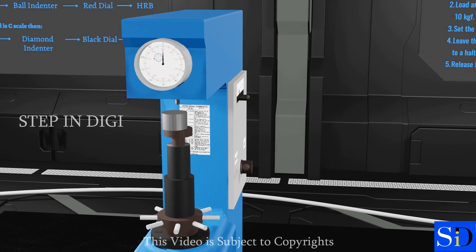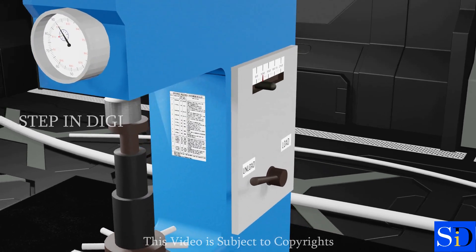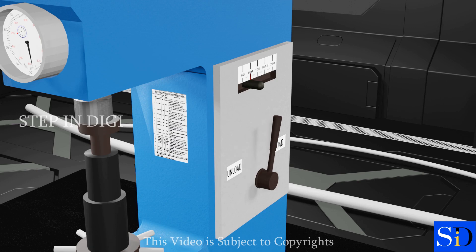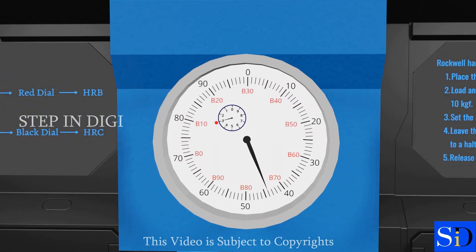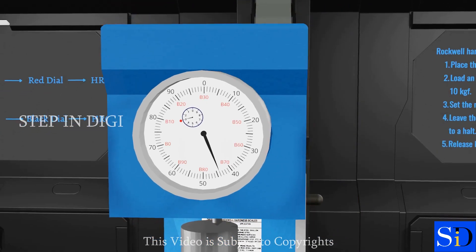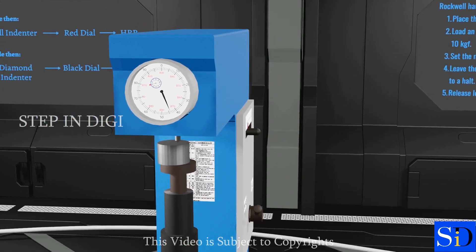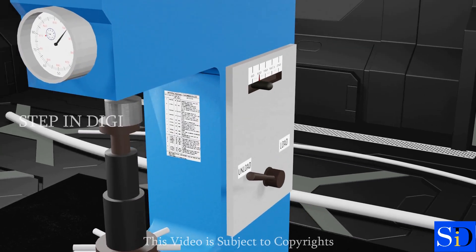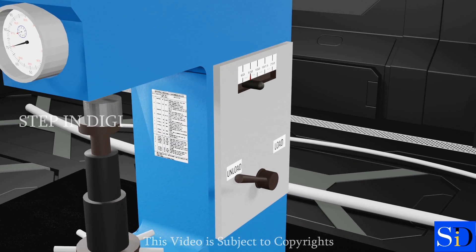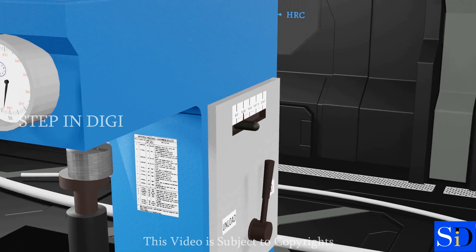While testing the specimen make sure that the indentation should not be made nearer to the edge of a specimen to avoid unnecessary concentration of stresses. The spacing between two adjacent impressions should be at least three times the diameter of indentation. Rapid rate of applying load to the specimen should be avoided. Load applied on the ball may rise a little because of its sudden action. Also rapidly applied load will restrict plastic flow of a material, which produces effect on size of indentation.